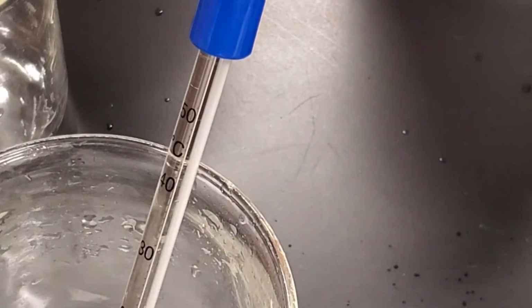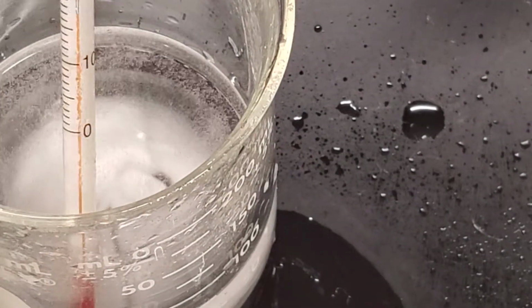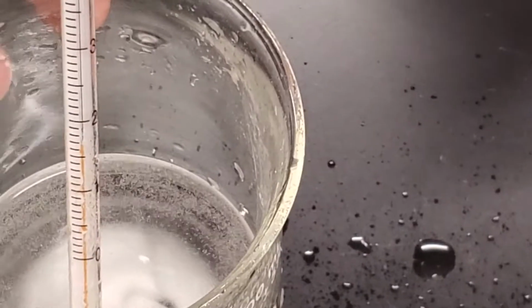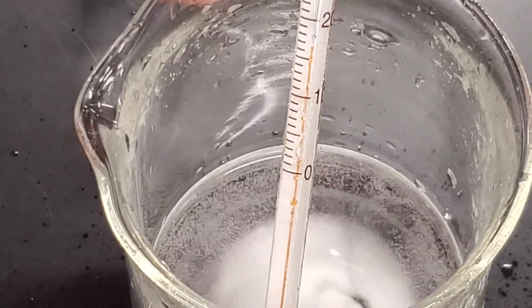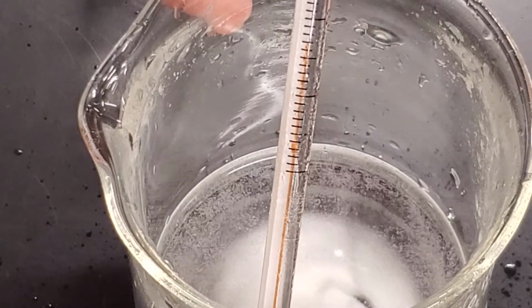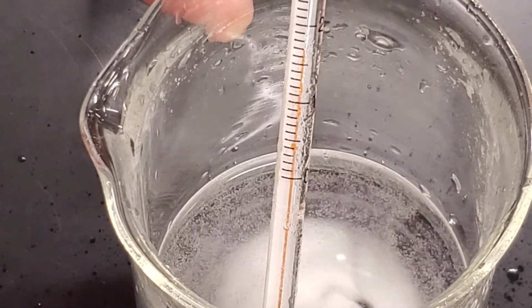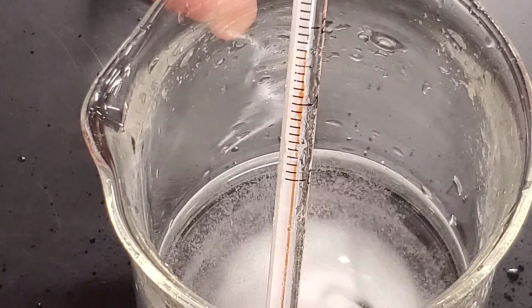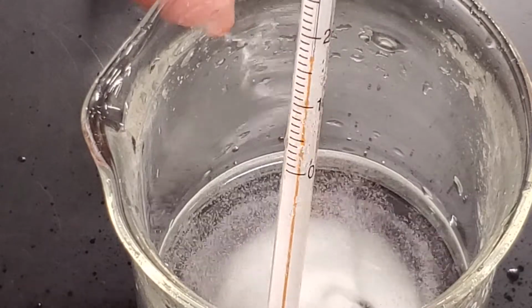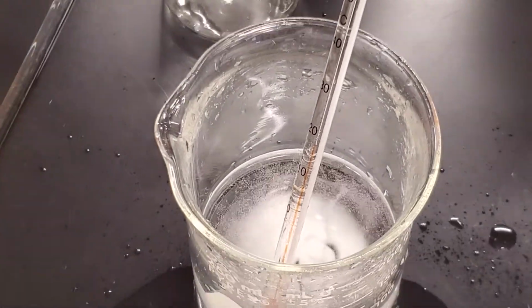And then that's probably good on the temperature, so we'll go ahead and take a look at that. Sorry for my camera here. There we go. So we see the 20-degree line. And to guess, it looks like it's about 3 hash marks below the 20-degree line. So we want to record that temperature next to the baking soda and vinegar.